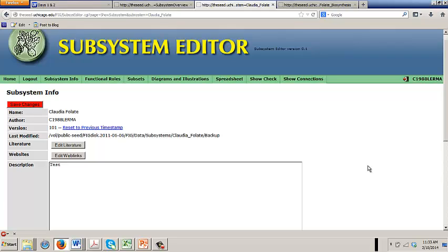So now I'm going to save the changes. What goes into a subsystem are genes, functional roles, that is, and genomes. So we're going to add, first of all, one functional role and one genome.